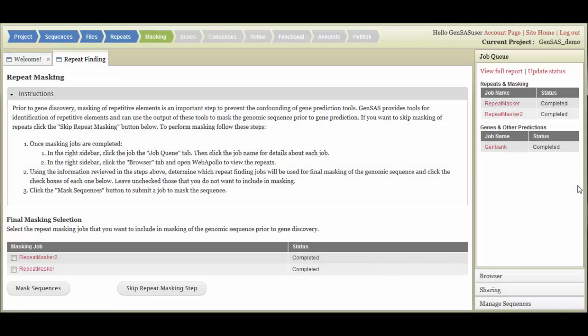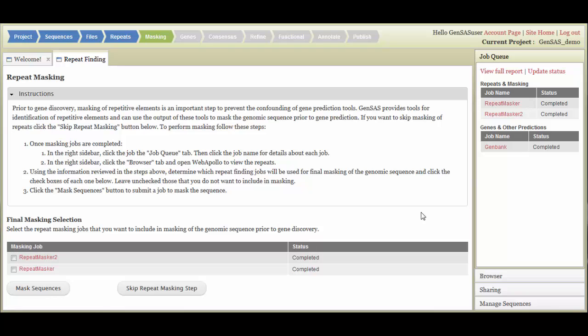Once all your repeat finding jobs have completed, you can use the Masking tab to create a mass consensus sequence for use with the other annotation tools. If you are working on a prokaryote or virus, just click the Skip Repeat Masking step to proceed to the Genes step. For eukaryotes, before starting the Masked Consensus, you will need to decide which sets of repeat data to include.